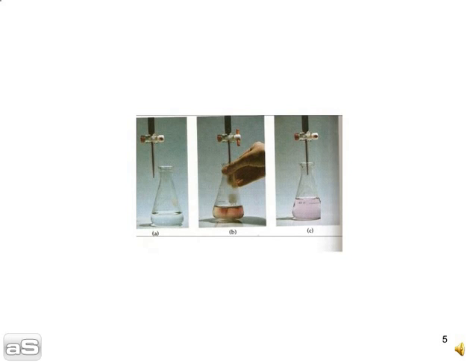Now look at this figure showing the three conical flasks marked A, B and C. In the figure marked A, a precise amount of oxalic acid has been weighed and dissolved in aqueous sulfuric acid. In figure B, the aqueous permanganate of unknown concentration is added from a burette. This is continued until the situation in C arises. That means the purple color persists, indicating that all the oxalic acid has been oxidized.